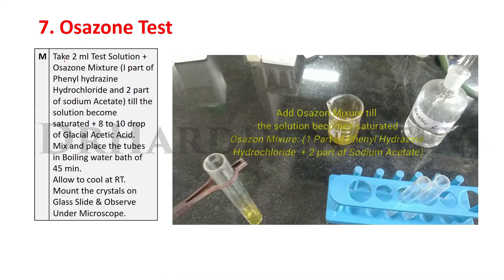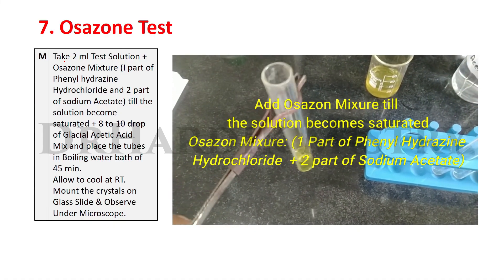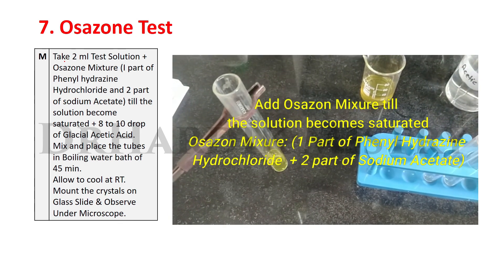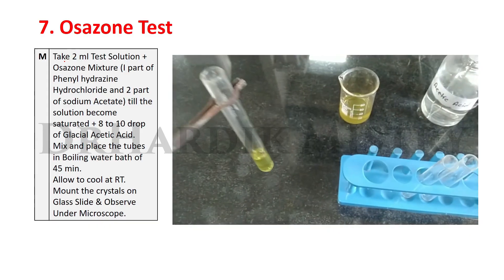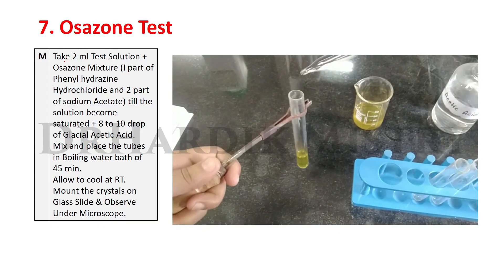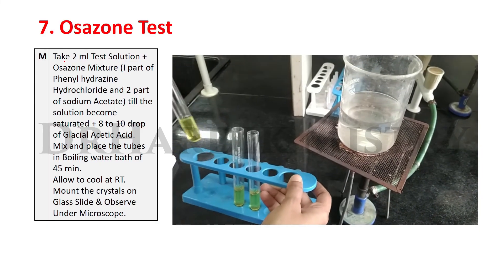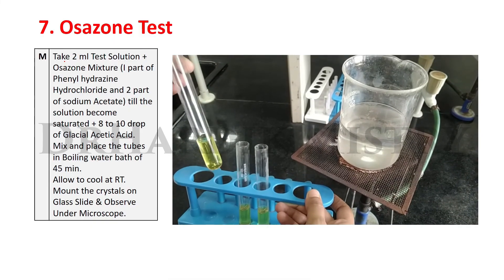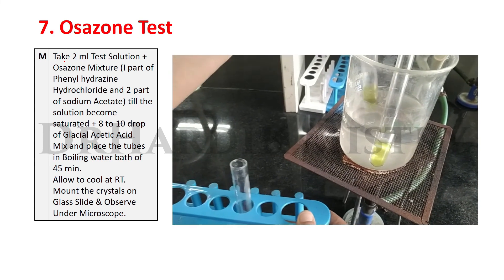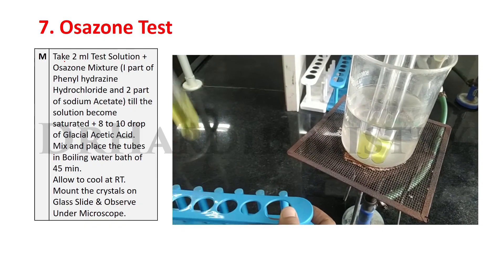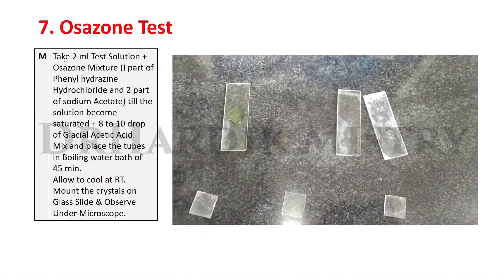Method: Take 2 ml test solution. Add osazone mixture, which contains 1 part of phenyl hydrazine hydrochloride and 2 parts of sodium acetate, until the solution becomes saturated. Add 8 to 10 drops of glacial acetic acid. Mix well and place the tubes in a boiling water bath for 45 minutes. After 45 minutes, allow test tubes to cool at room temperature. Mount the crystals on a glass slide and observe under the microscope.